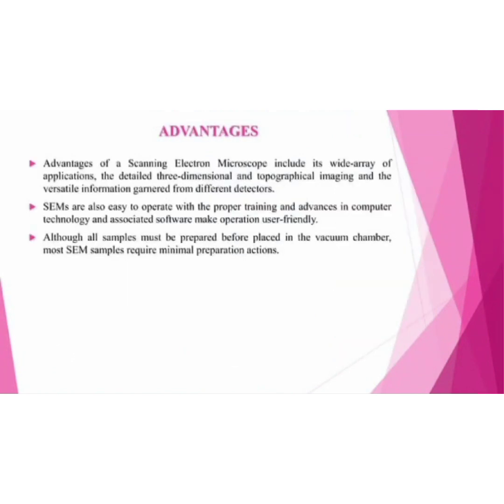Advantages. Advantages of the scanning electron microscope include its wide array of applications, detailed three-dimensional and topographical imaging, and the versatile information gathered from the different detectors. SEMs are also easy to operate with proper training, and advances in computer technology and associated software make operation user friendly.